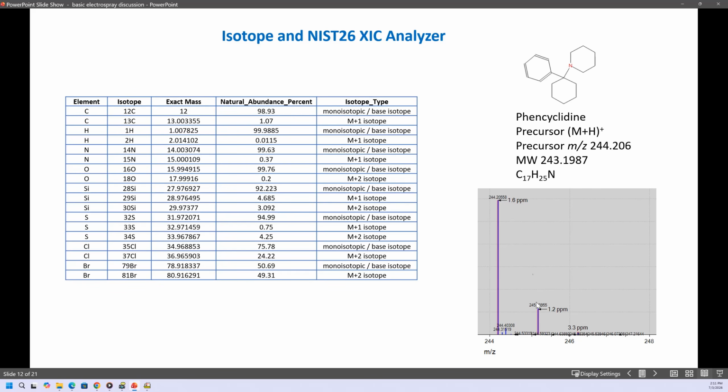So very good results. And on top of that, the mass accuracy for this ion is within 1.6 parts per million of the theoretical, and even less than 2 and 3 even for the double C13. So you have a lot of information that points to this being a very good candidate for this compound.